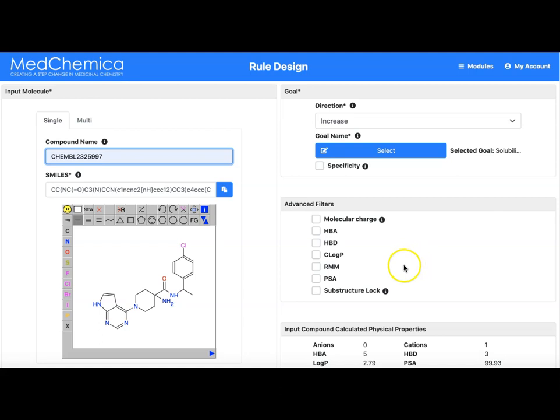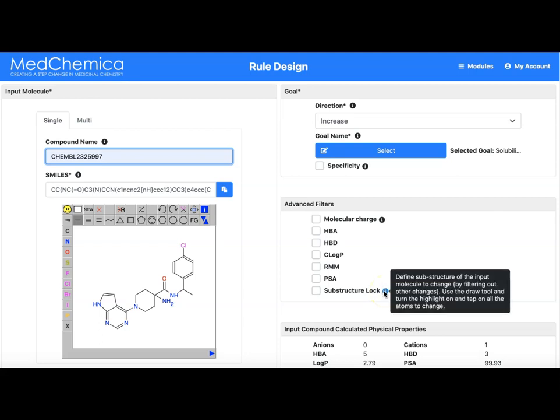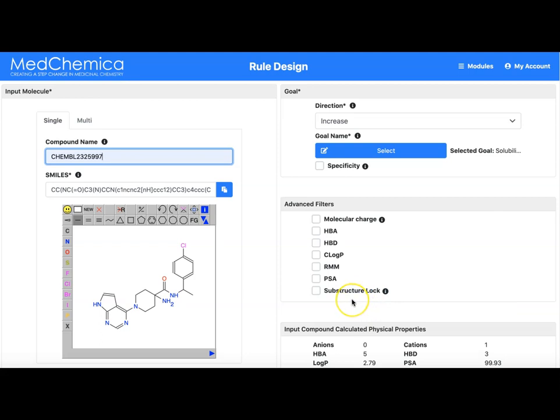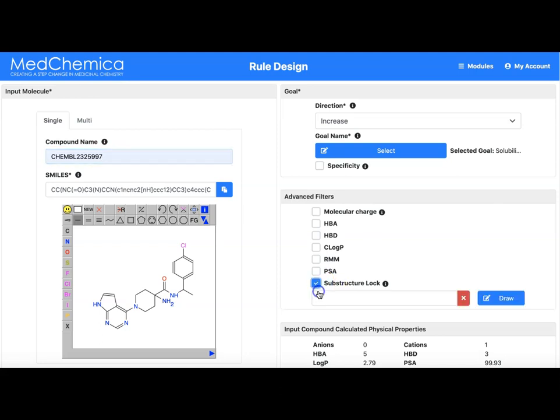The last filter is called the substructure lock. Hovering over the information icon will remind you what this feature does. Without the feature being clicked on there will be no filtering of the products based upon substructure. If we enable this feature we can then enter a substructure lock. A substructure lock is a substructure that must be present in the final products.